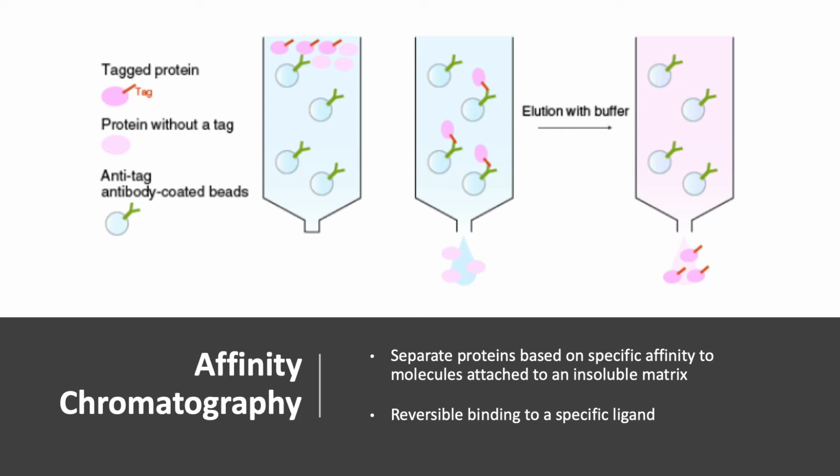attached to an insoluble matrix. In this diagram, the tagged proteins are separated as they bind specifically to the anti-tag antibody-coated beads, while other molecules are washed away.